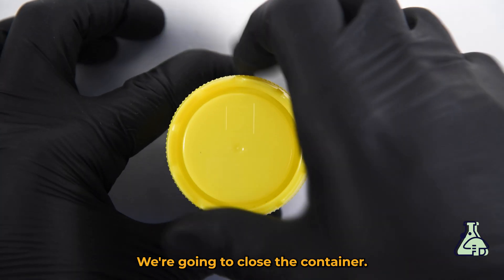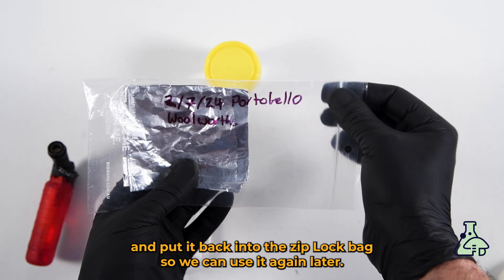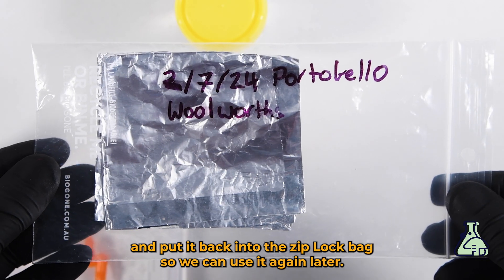We're going to close the container, fold the foil, and put it back into the ziplock bag so we can use it again later.